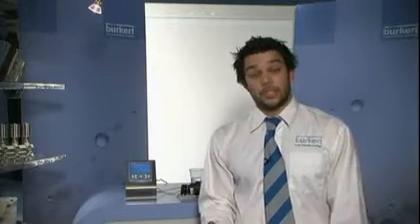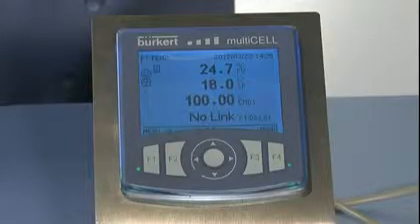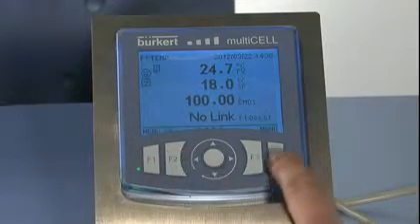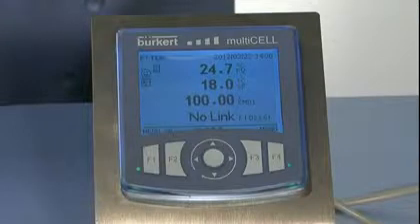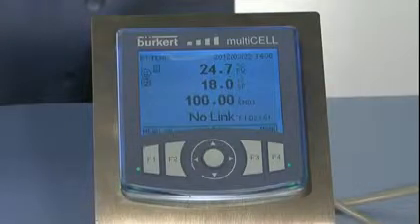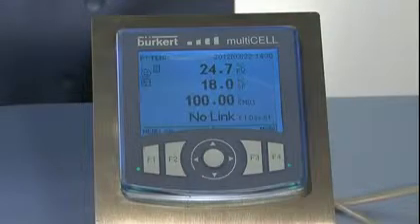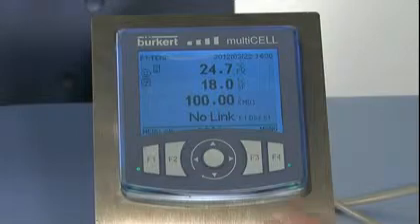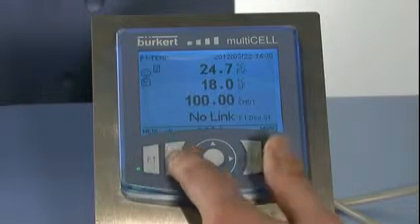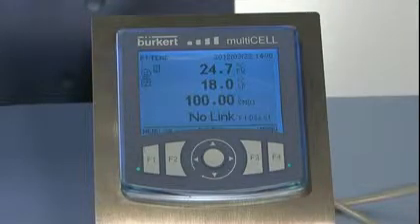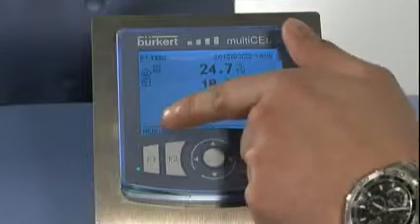The 8619 also features soft keys which make navigating the menu very easy. The soft key features aren't static — they're dynamic. When you go into a top-level menu, with a typical device you'd need to scroll through to get to the option you'd like, then into a sub-menu, and further into more sub-menus. What the Multicell does is have soft keys with mapped options that change for each level of the menu, so you can navigate very quickly and efficiently.